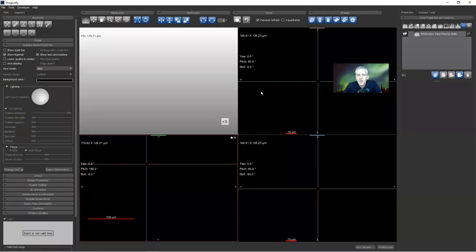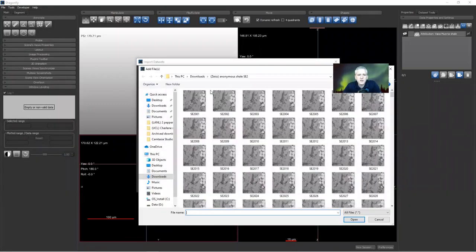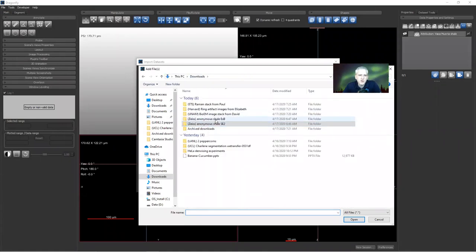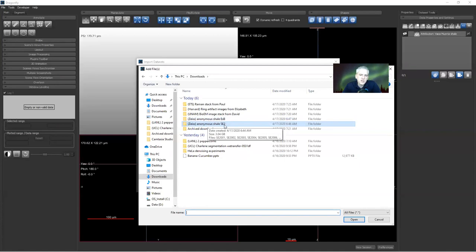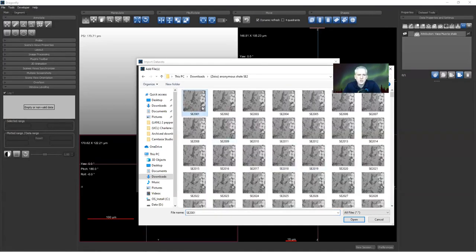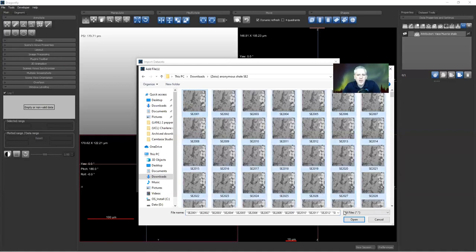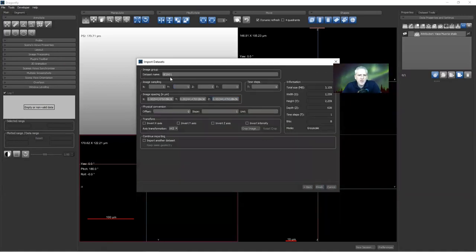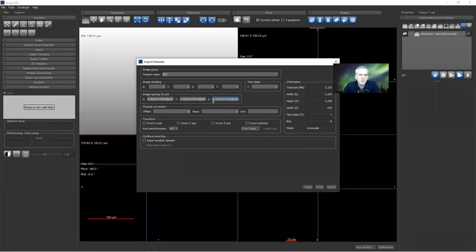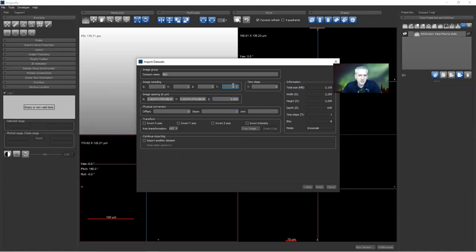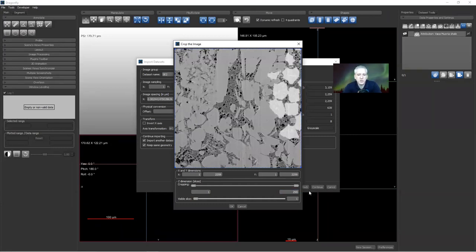I'm going to pop up Dragonfly. I'm going to import two image data sets. I'm going to go to Import Image Files. In my Downloads folder, I've got a folder called Zeiss Anonymous Shale ESB for Energy Selective Backscatter, and then I have Zeiss Anonymous Shale SE2. This is from the secondary electron detector, one of the secondary electron detectors on the microscope. I'm going to select the SE2, do a Control-A and click Open. At this point, I'm going to name this my SE2, and pixel size is 2.5 by 2.5 by 5. It doesn't have the depth encoded, and that's common in image stacks. I'm going to tell it to import that, but I'm also going to tell it to import another data set to keep the same geometry.